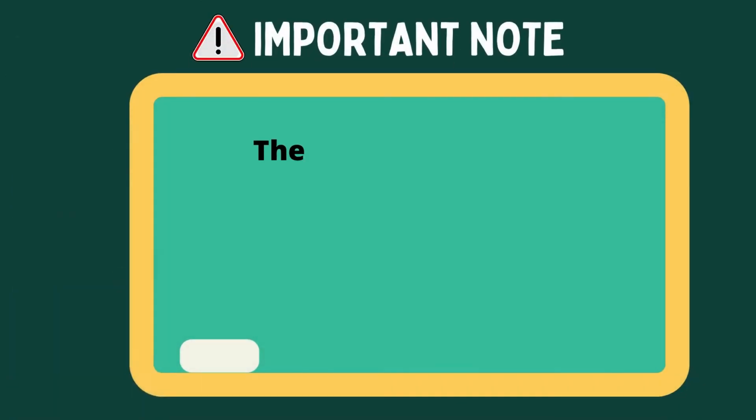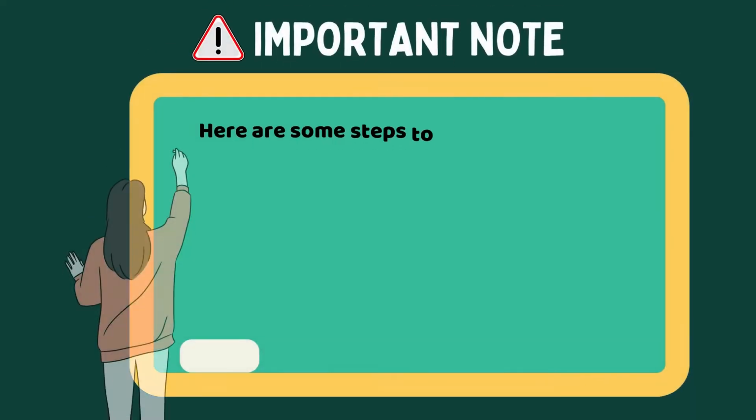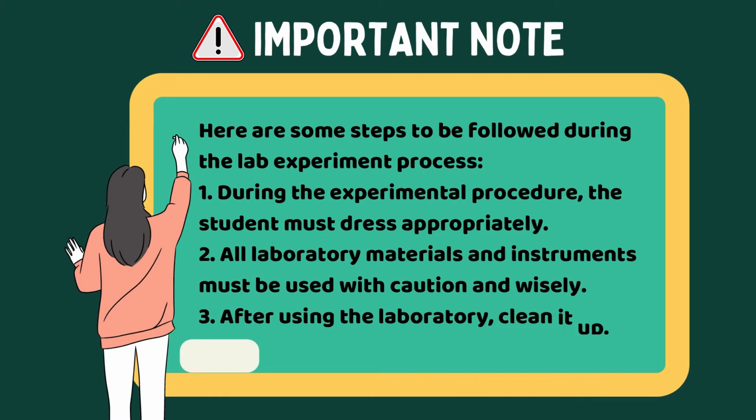Important note, the same experiment procedure was repeated for both before and after treatment of meat chilled at 15 to 16 degrees Celsius and 4 degrees Celsius after 24 hours. Here are some steps to be followed during the lab experiment process.